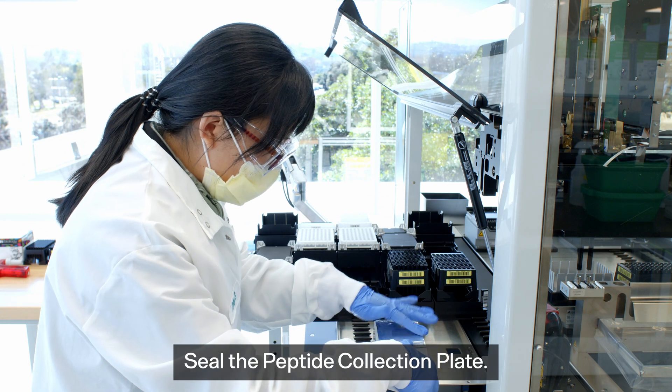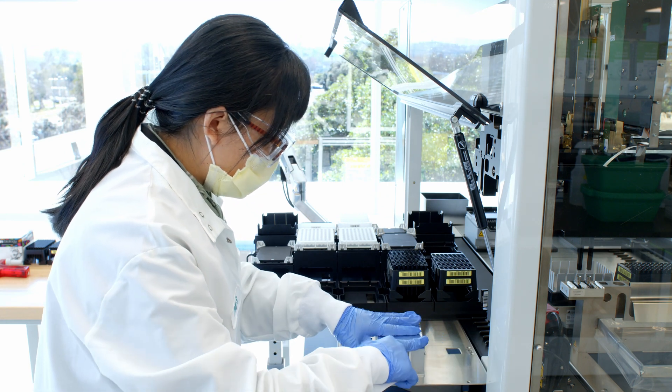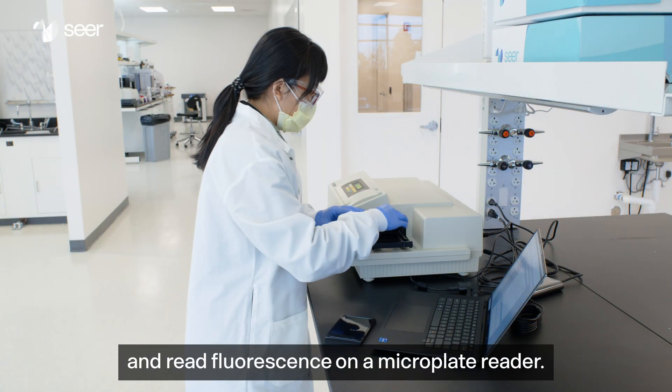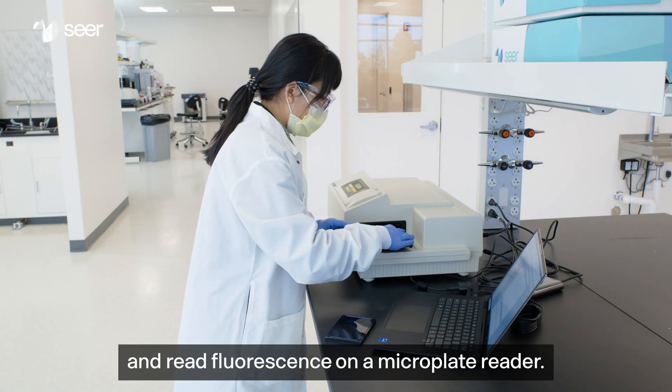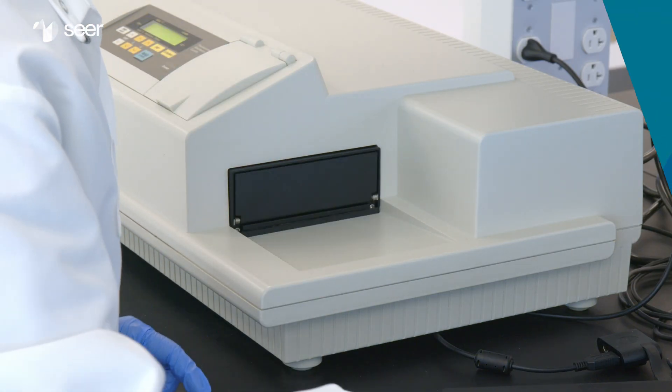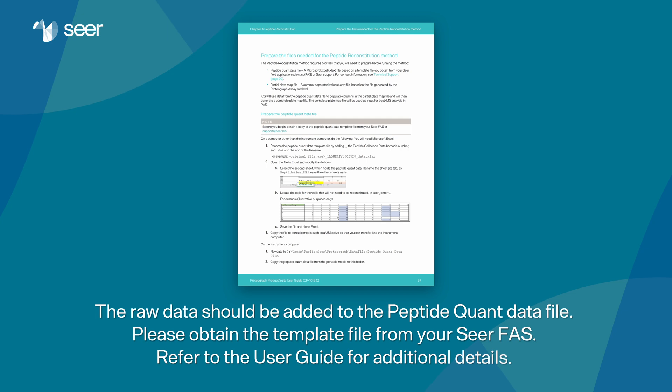Seal the peptide collection plate. Remove the black quantitation plate and read fluorescence on the microplate reader. The raw data should be added to the peptide quant data file. Please obtain the template file from your Seer FAS. Refer to the user guide for additional details.